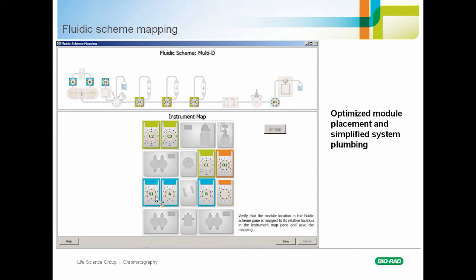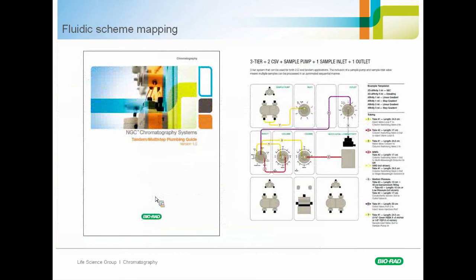So having spoken about the principles now, I'll now show you a couple of examples of some very common purification methods that people do globally. The first one is a simple antibody purification.